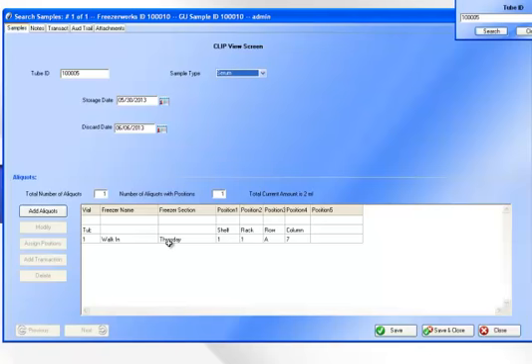Now I go to the Thursday freezer. I go to rack 1. I pull out rack 1. I go to A7, and there it is. And I pull it out, and I can do my work.